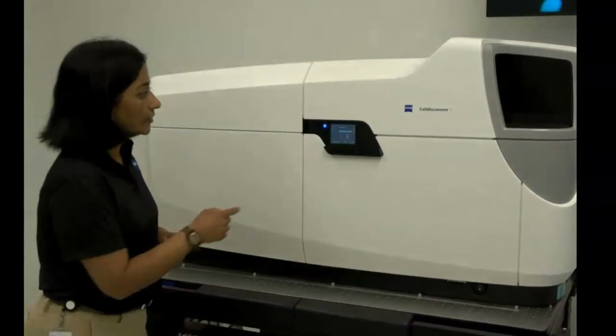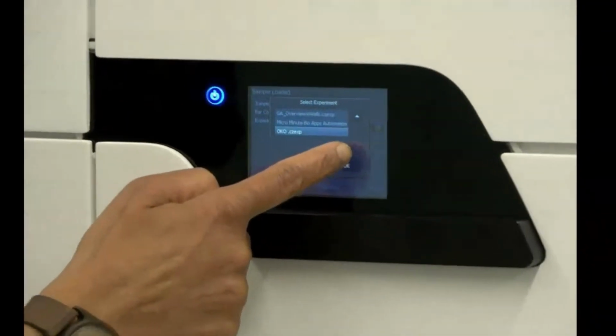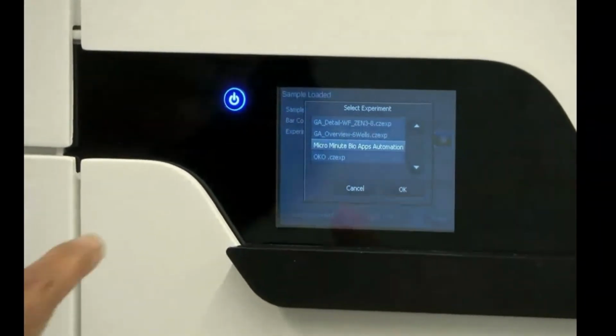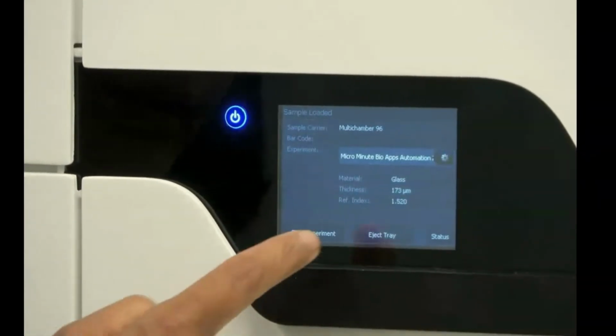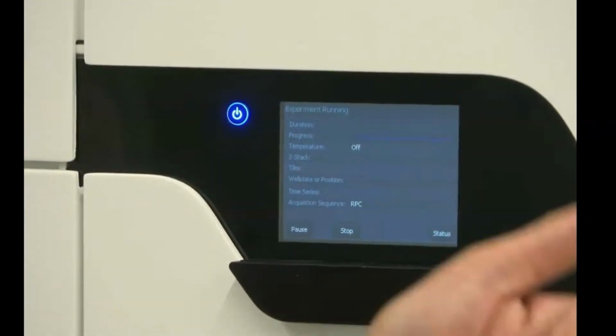So right here, you see this drop-down menu. I'm going to select the experiment, per Michael's wish, that combines acquisition and analysis. So I'm going to say OK and start experiment. So Michael, if you can pan over again to the software.